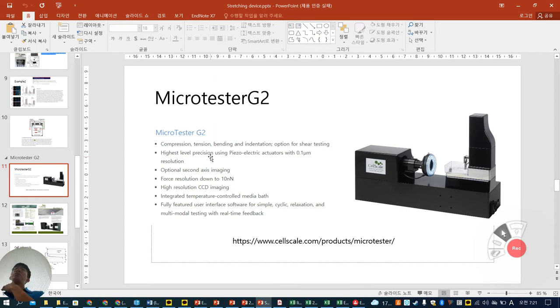저희 PDL 하려고 했었죠. PDL. 지금 이제 스트레치 가지고 하는데. 네. 컴프레션 시스템 하나 만들죠. 네. 지금 매뉴얼로 PDL을 그렇게 동전을 하고 있는데 이게 뭔가 좀 하여튼 크루드 해요. 성길이랑 하고 있는데 하여튼 되긴 되거든요. 근데 크루드 해가지고. 몇 천 원에 해결하려는데. 네. 요거 하면 그래도 괜찮을 것 같다.